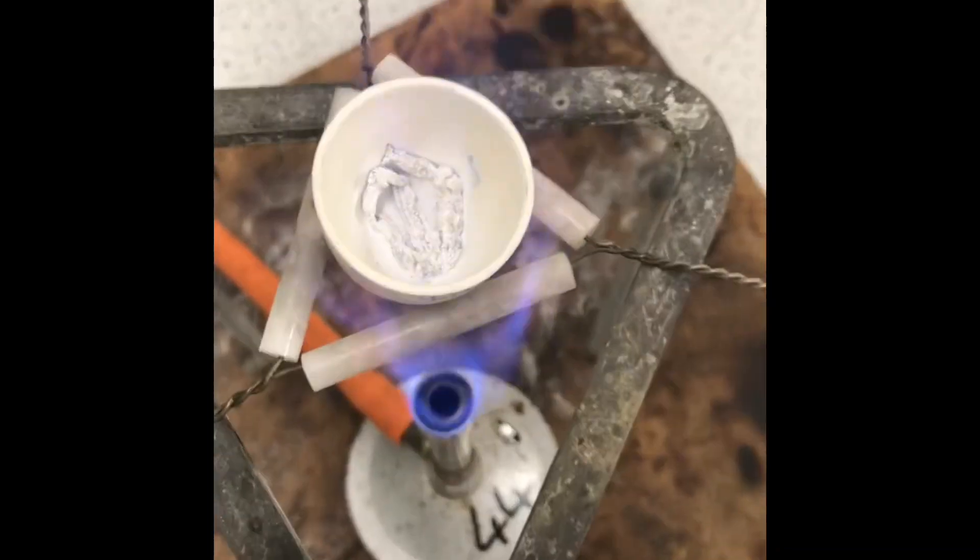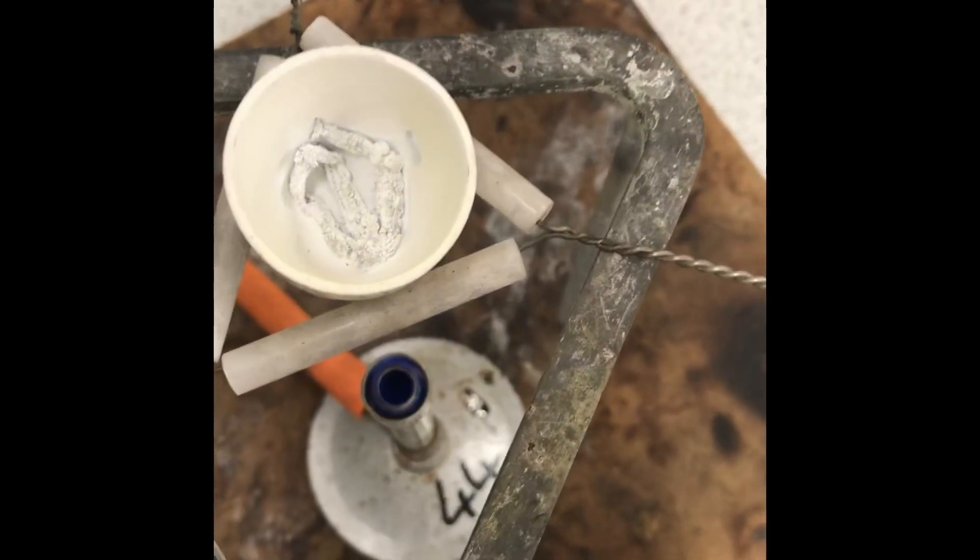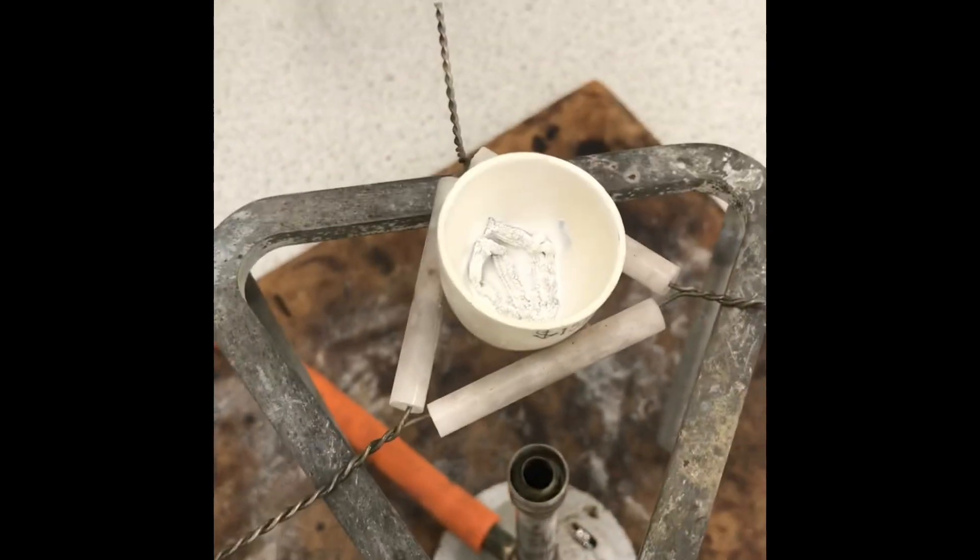As the magnesium oxide has formed, the reaction is now complete, so I can turn off my Bunsen burner and remove the crucible from the heat.